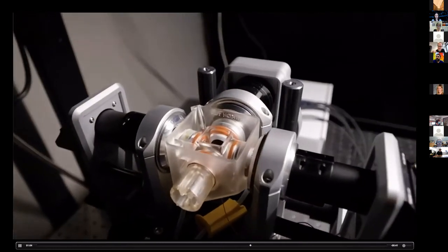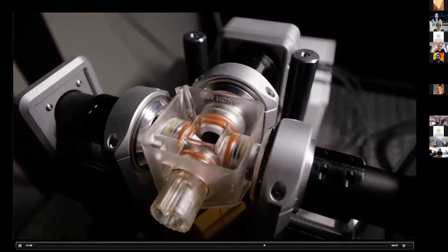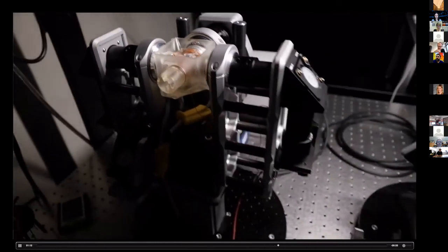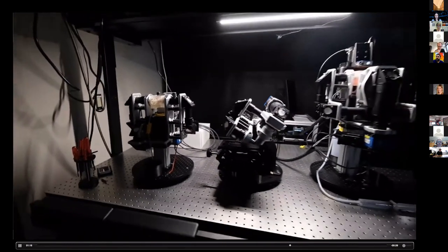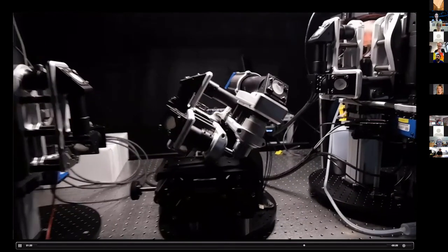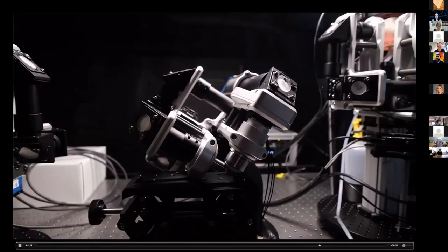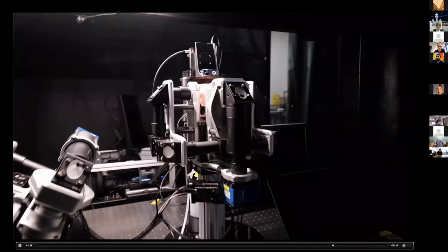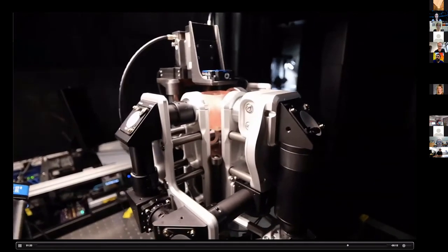So this is a T-SPIM configuration, 2 illumination lenses and 1 detection lens in the classical light sheet configuration. And then there's other configurations here on the right. This is what we call a V-SPIM in the center, where we have 2 lenses dipping into a Petri dish from the top. This is a 25x 1.1 NA lens for high resolution imaging. And then here on the right is another T-SPIM fully equipped with perfusion, heating, and the stages on top.